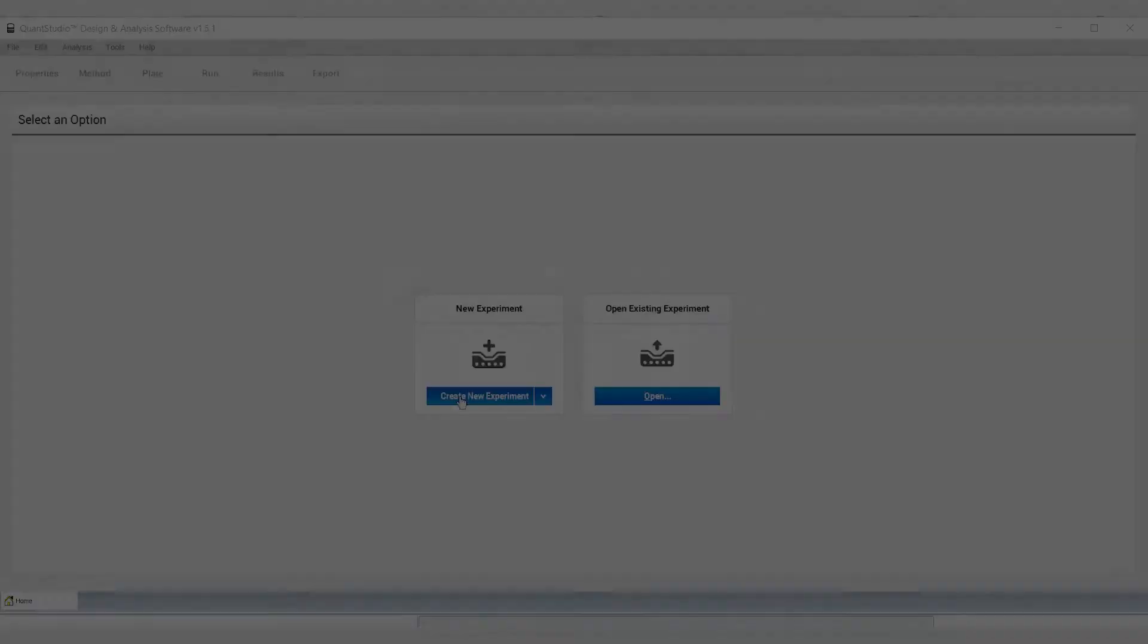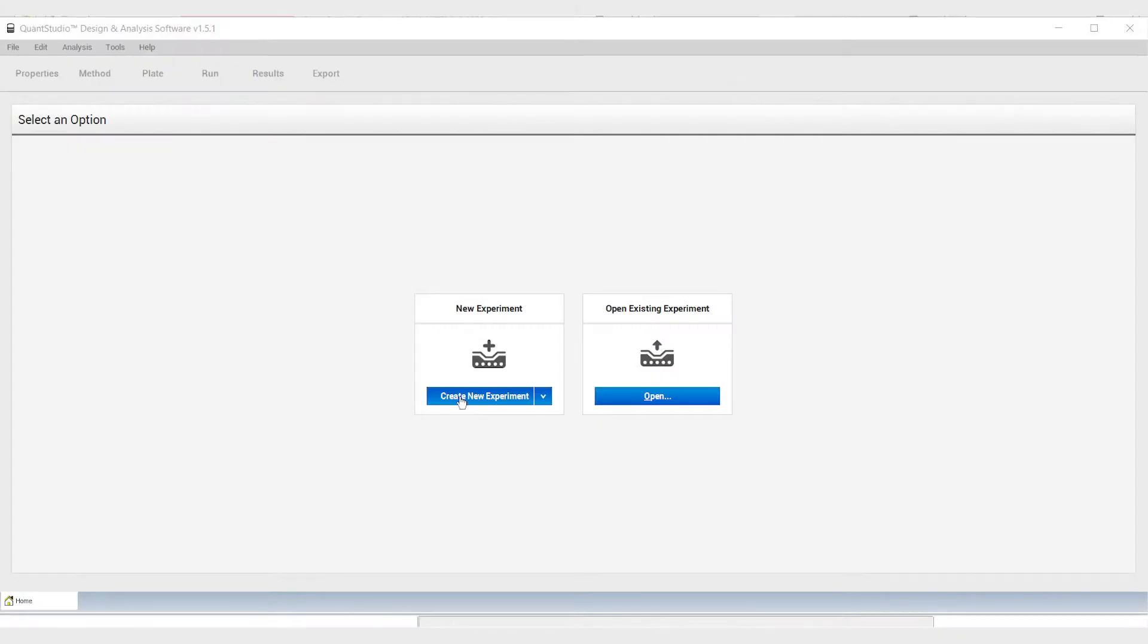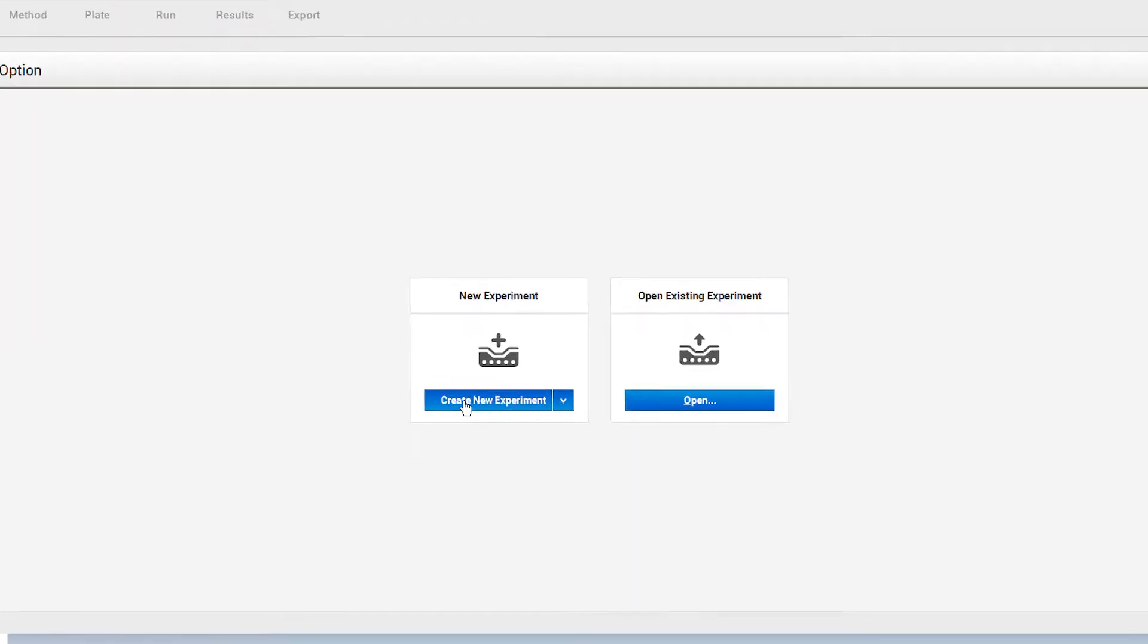It is vital to use the genotyping experiment type in order to perform analysis of the TaqMan SARS-CoV-2 mutation panel. In this example, we're using the instrument software for the Applied Biosystems QuantStudio 5 real-time PCR system.